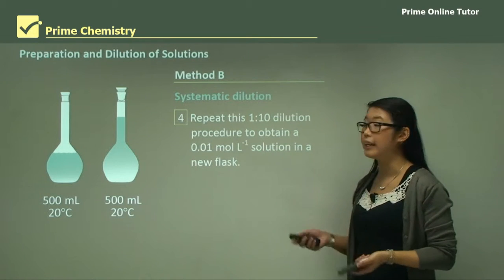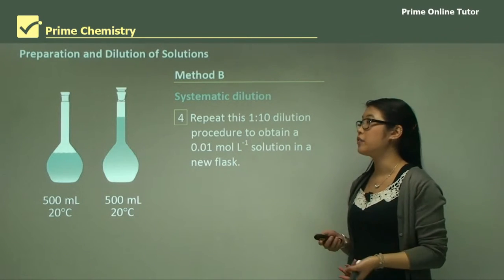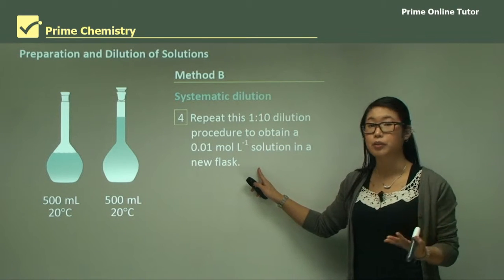We then repeat this again because we're making another 1-in-10 dilution. We get a clean pipette, transfer 10 mL into another 100 mL flask, and make it into a new dilution.